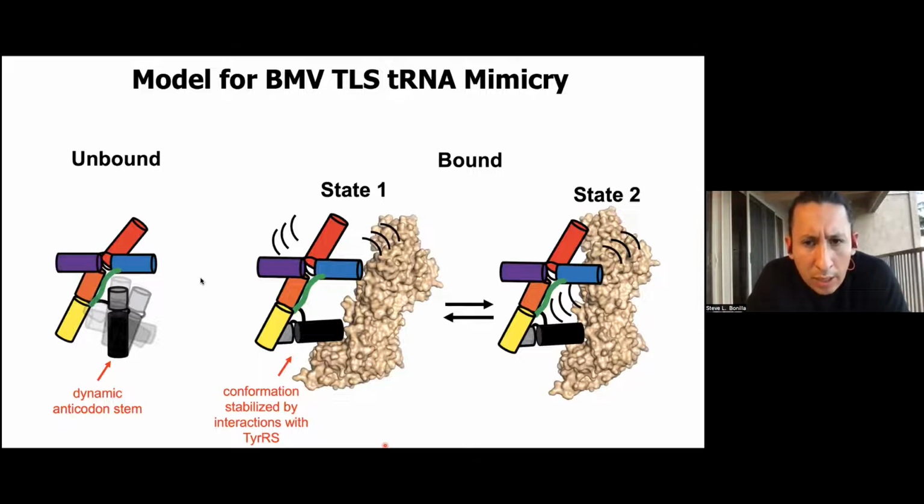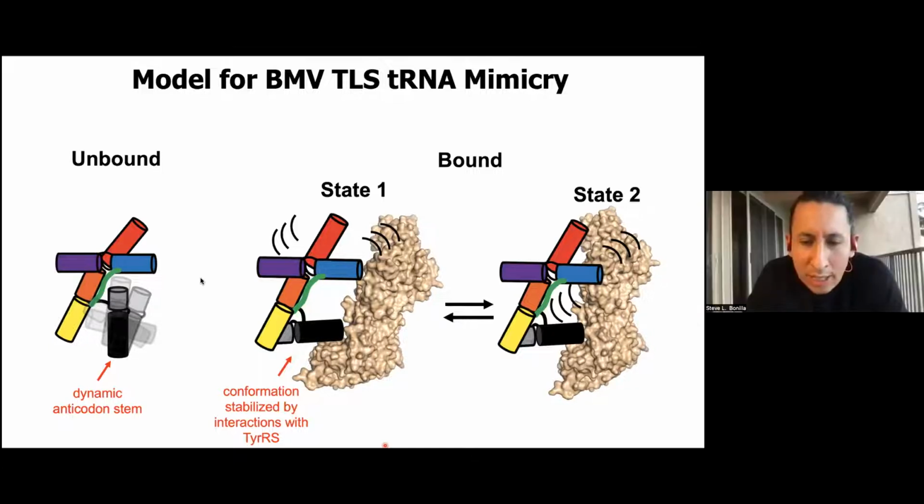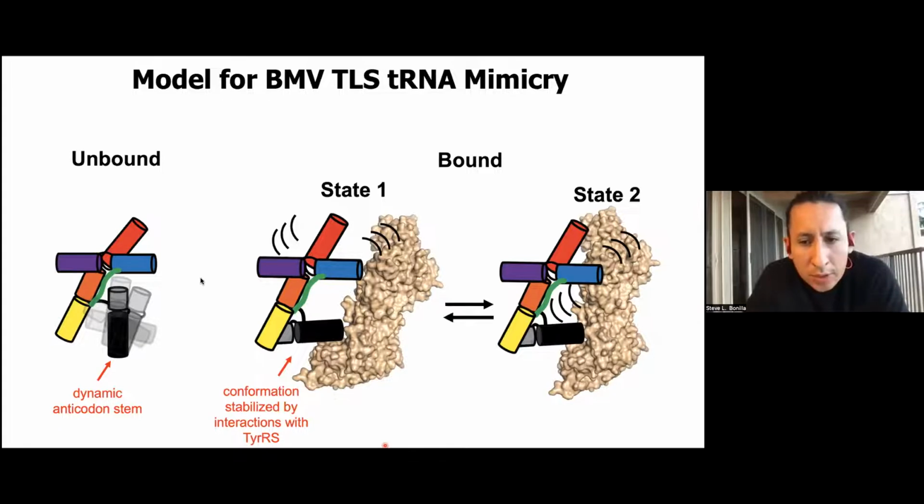Is it cryoEF? Yeah, that sounds right. A couple people chimed in, so thank you, audience. We used that, and it recommended 20 degrees. But after discussing with the PNCC team, we decided to also collect at 40 degrees, I believe. So we did two different angles.